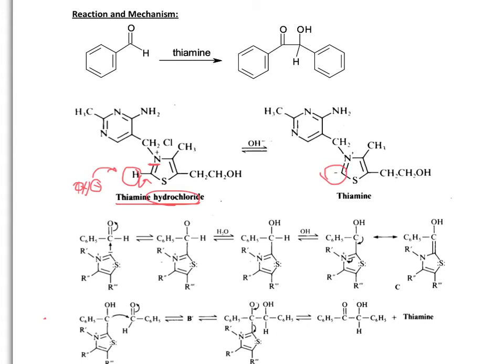At that point, you're going to add the sodium hydroxide. Again, the reason you're adding sodium hydroxide is that you want to get rid of the HCl, and you want to get rid of the most acidic hydrogen, like I was talking about earlier. And so you are going to see a big change in color. It's going to go from the white slurry-like consistency to a very bright, very stark, golden yellow color. It's a very bright color that you will see.